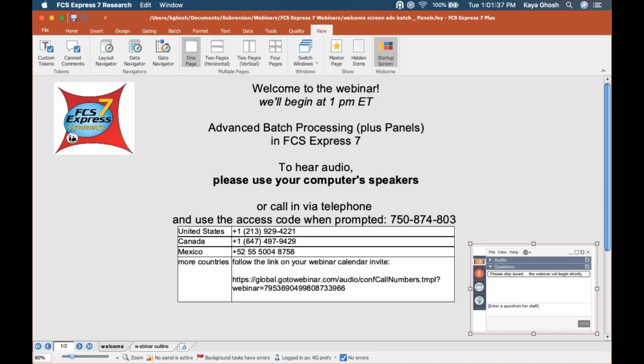So what are we going to talk about today? Today's webinar is about advanced batch processing plus panels. Last week we did a getting started in FCS Express webinar where we set up a basic batch process, and I'll be doing that again with you today. I'm not going to set up the layout because we covered that in getting started, but I will use a layout that's already set up to review setting up a basic batch process.